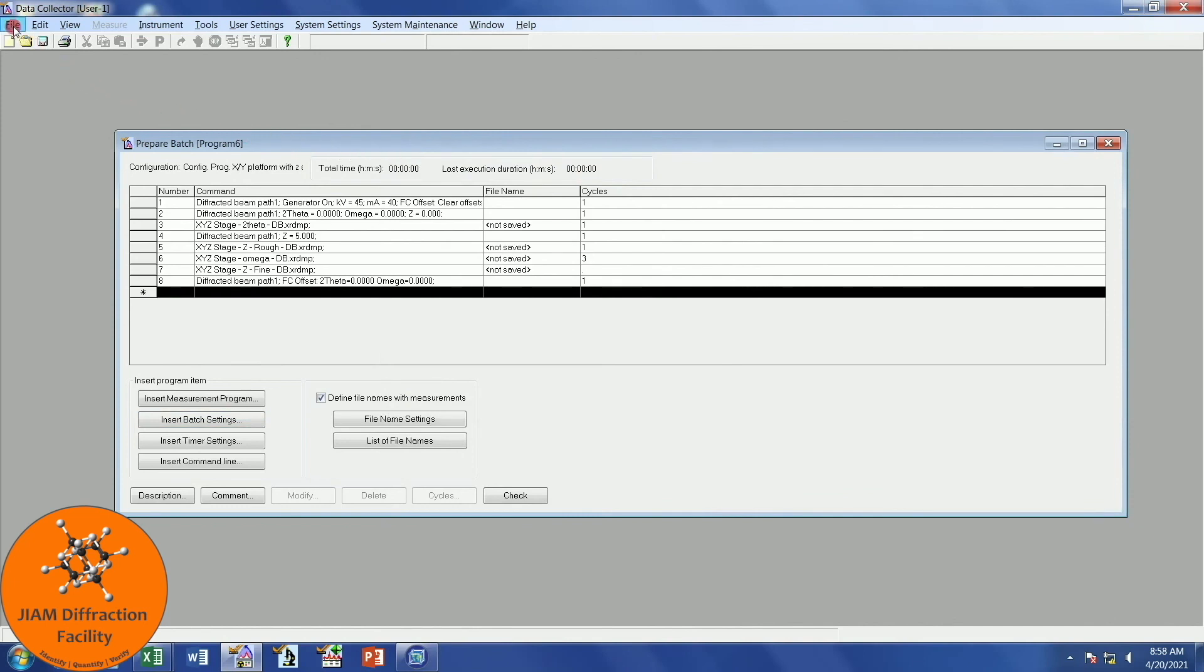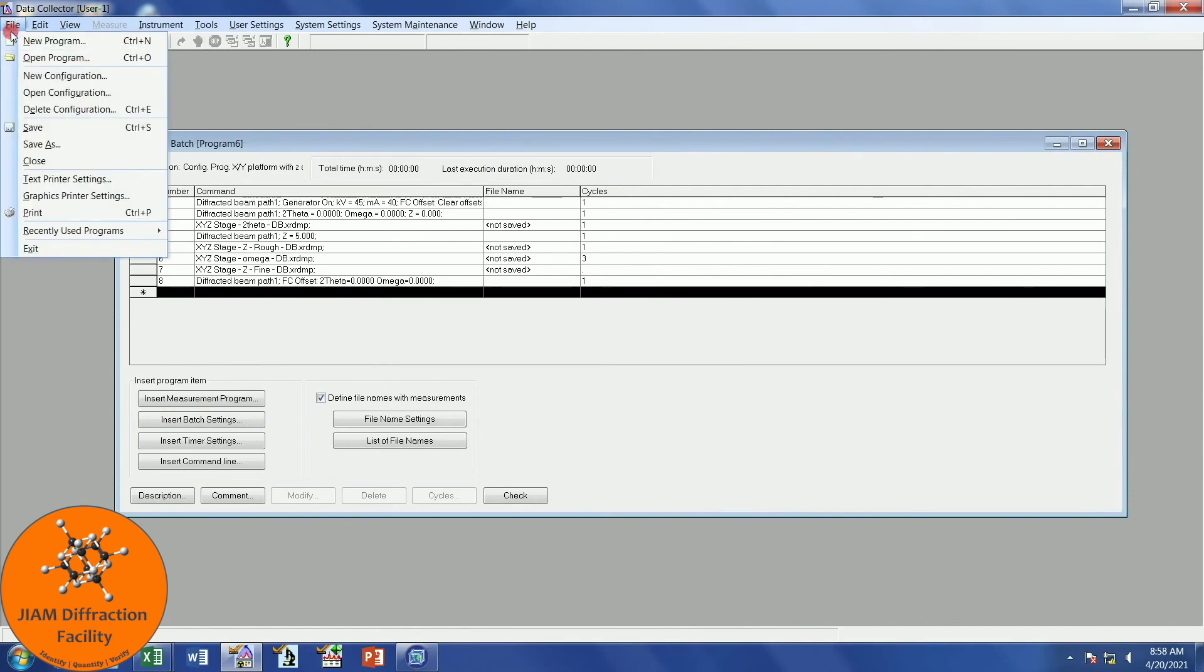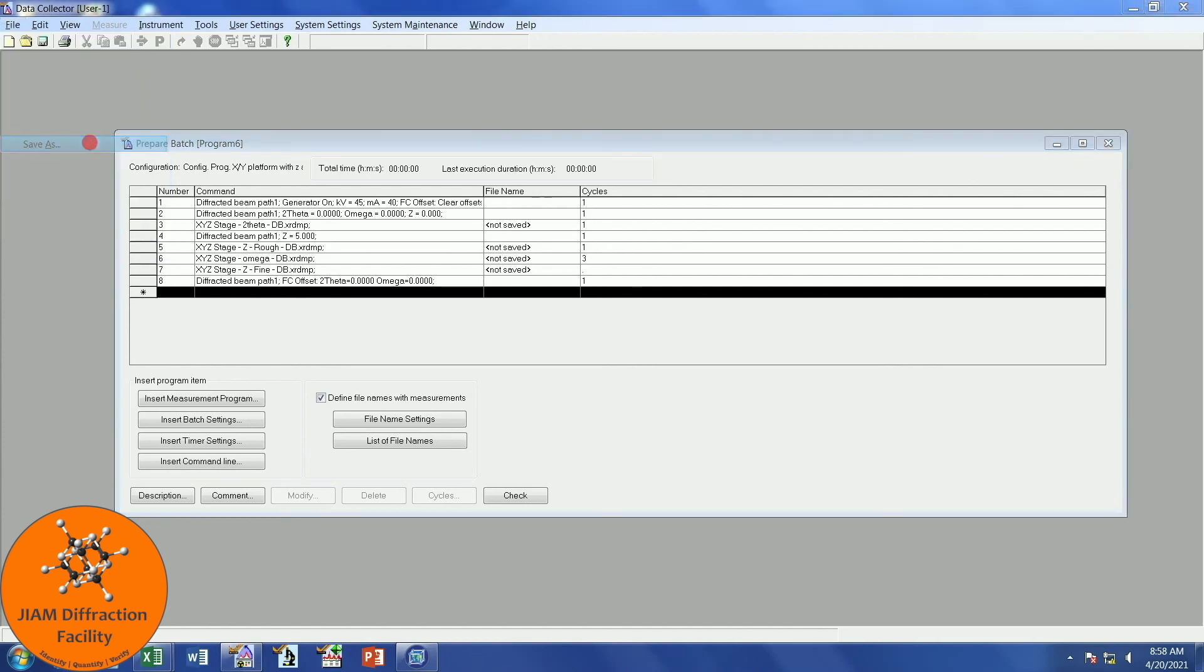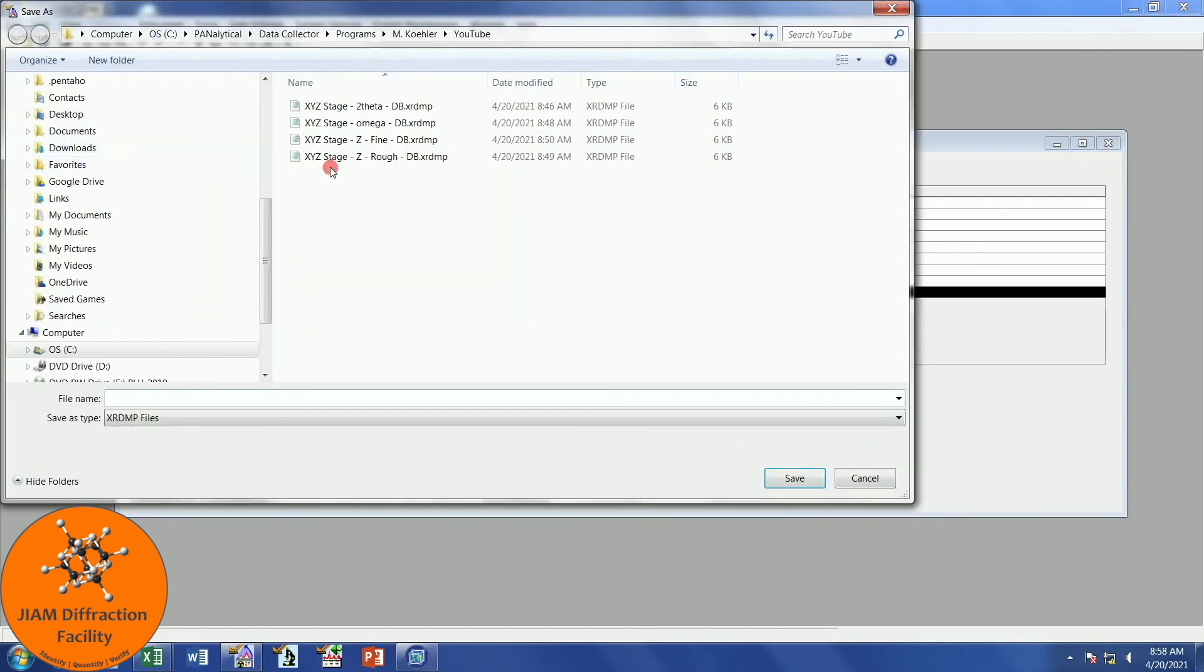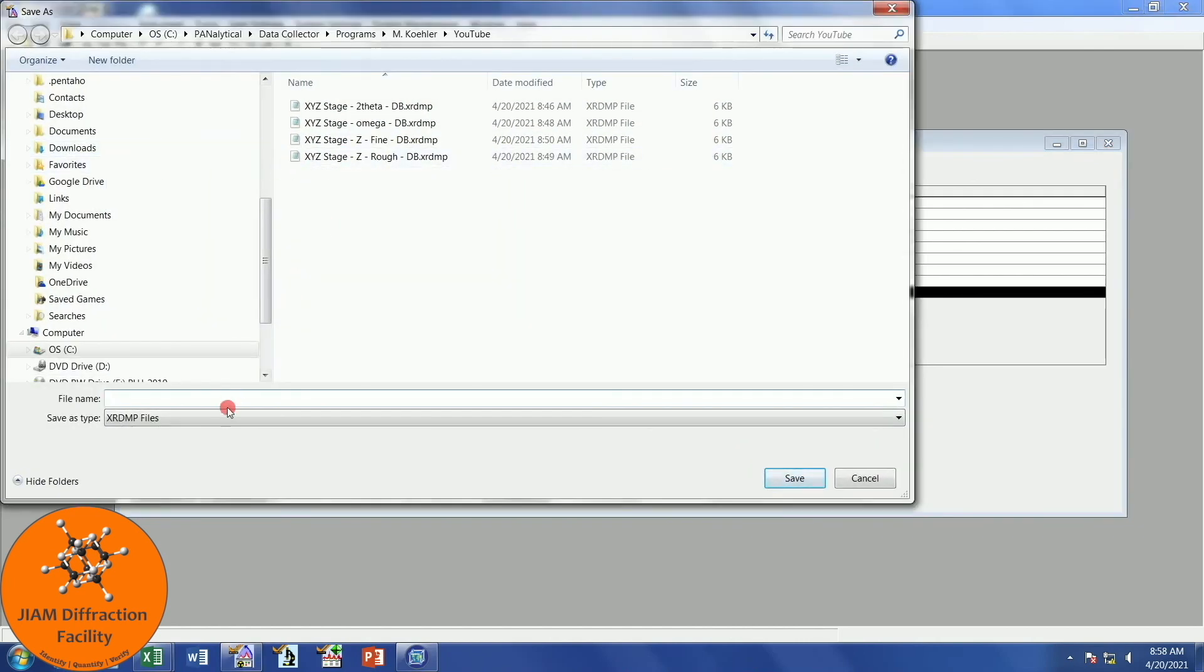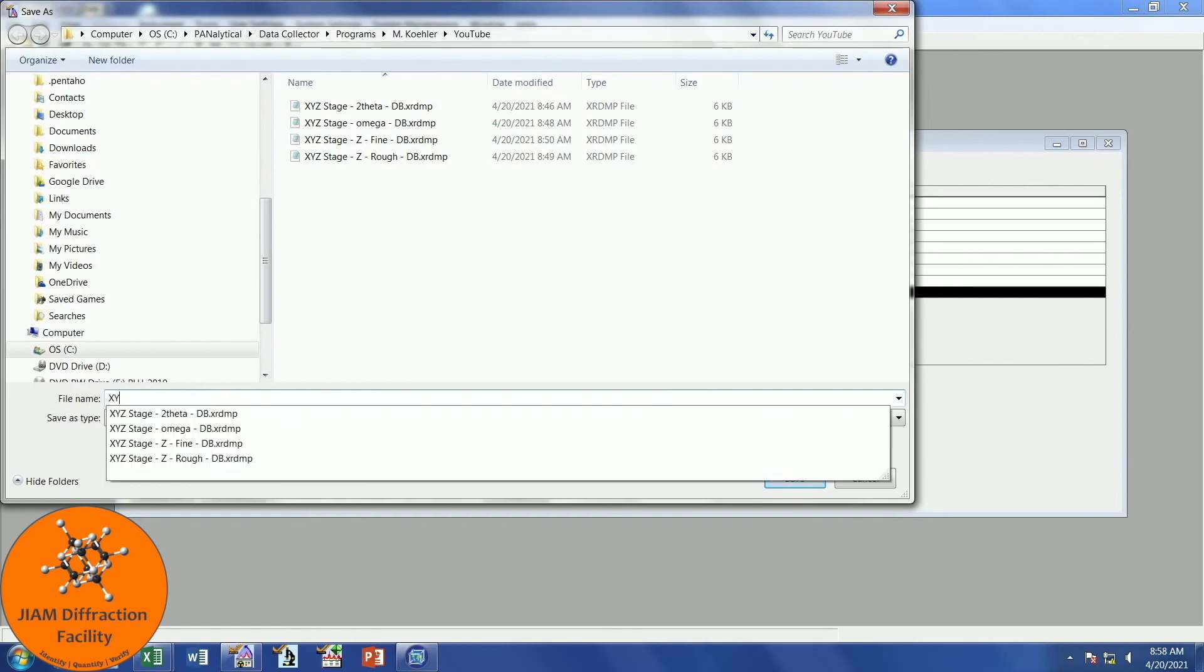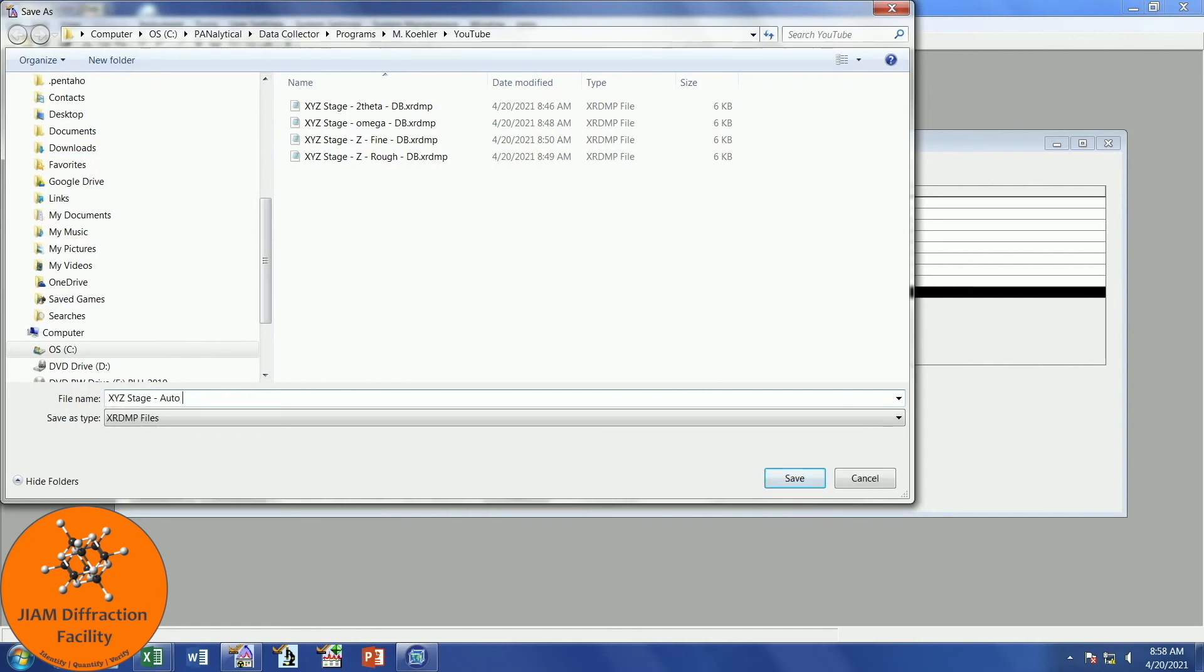Make sure that you go to File, Save As. I will just type this one, the XYZ stage, this is Auto Alignment, and it is the Batch Program. Enter. And that is pretty much it.